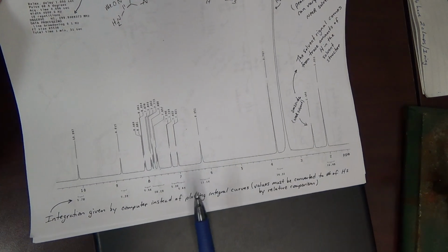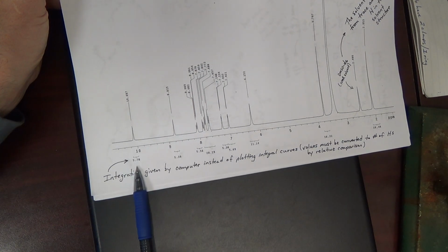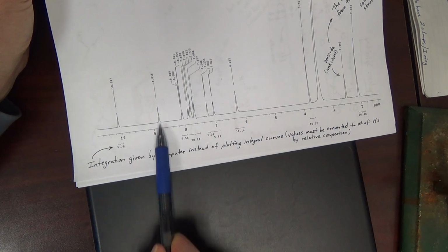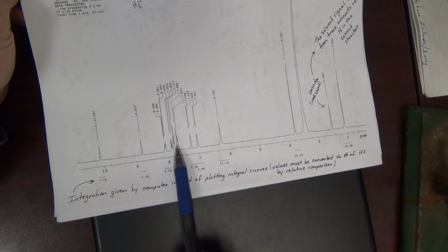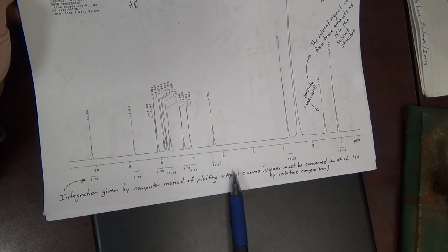Here, the integration is given below the baseline. So this is the integration for each signal. These 3 signals were integrated all together. Separate integration.